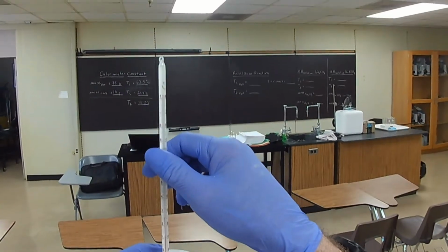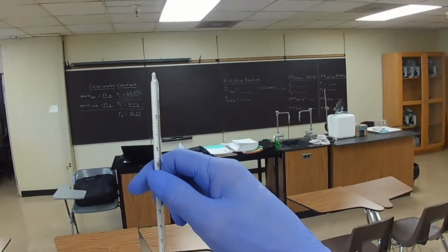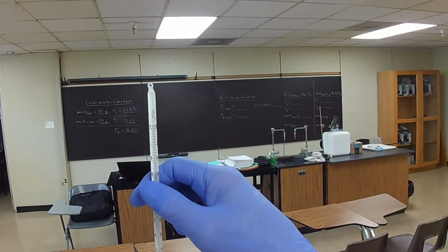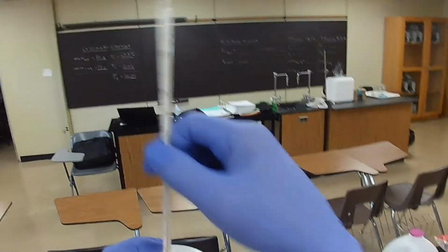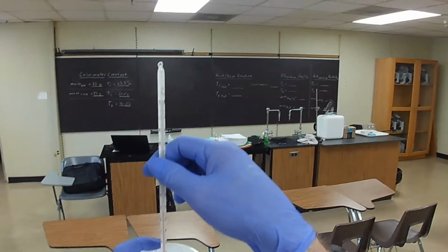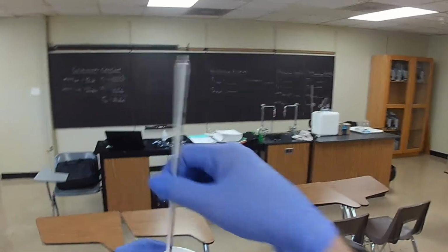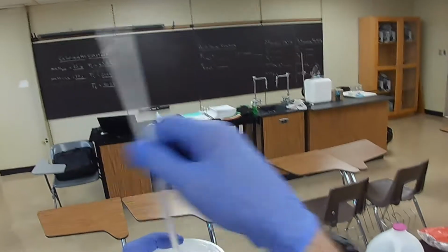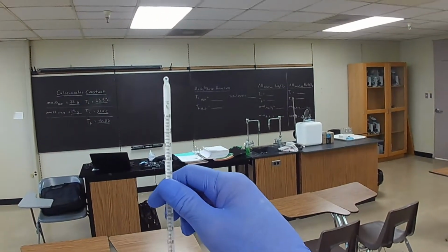It's on the rise. 25. 26. 26.5. Creeping up just a hair. Make that last uncertain digit.